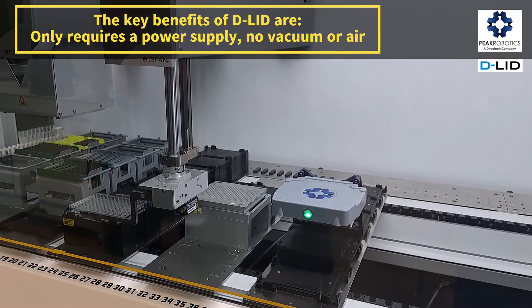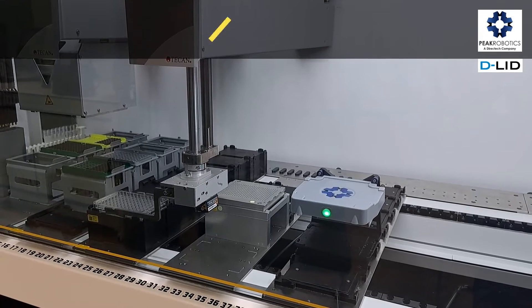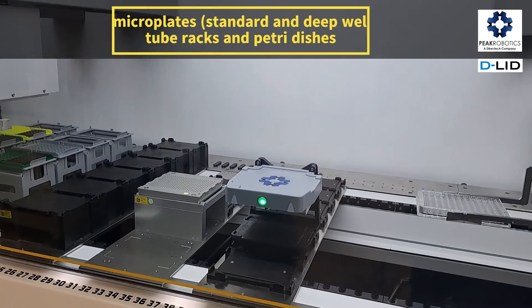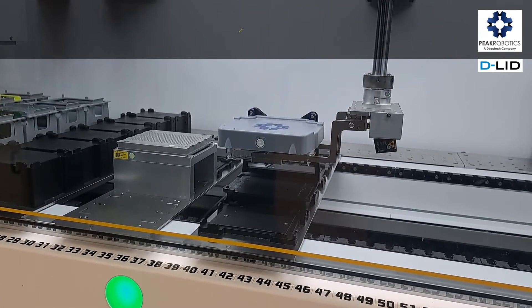The key benefits of a D-Lid are: it only requires a power supply — no vacuum or air. It is easy to set up; teach one position for delid and relid. And it can delid microplates, standard and deep well, tip racks, tube racks, and petri dishes.